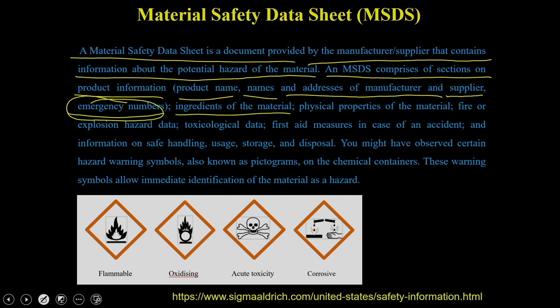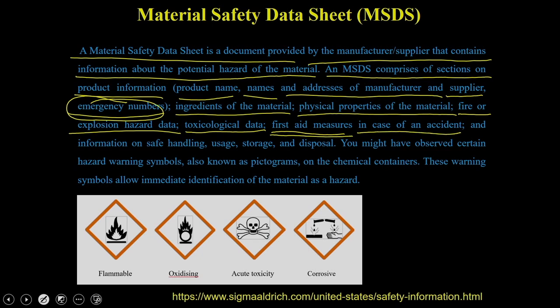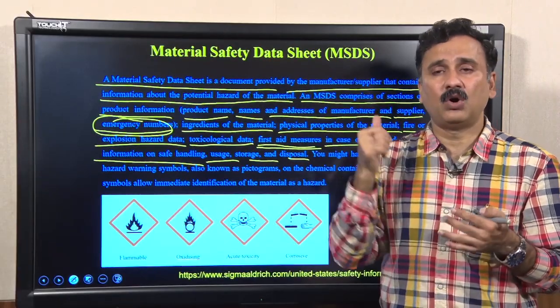The MSDS will tell you the ingredients of the material, its physical properties, and fire or explosion hazard data — whether the material will catch fire or is explosive. It also provides toxicology data including the toxicology exposure limit and the LD50 of that particular material, first aid procedures in case of burns or exposure, and information on safe handling, usage, storage, and disposal. All the information required before using a chemical is provided in the material safety data sheet, or MSDS.